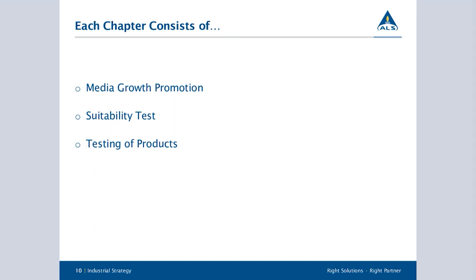So why is it required? Now, obviously, to meet the USP guideline, it must be tested. But the theory is that the products are generally known to have antimicrobial properties because of the presence of preservatives or of its formulation. Therefore, these must be neutralized by various methods such as dilution, filtration, or a combination, to make sure that we are able to inactivate the preservative and allow the growth of the organism to be detected. So therefore, we don't receive a false negative result.